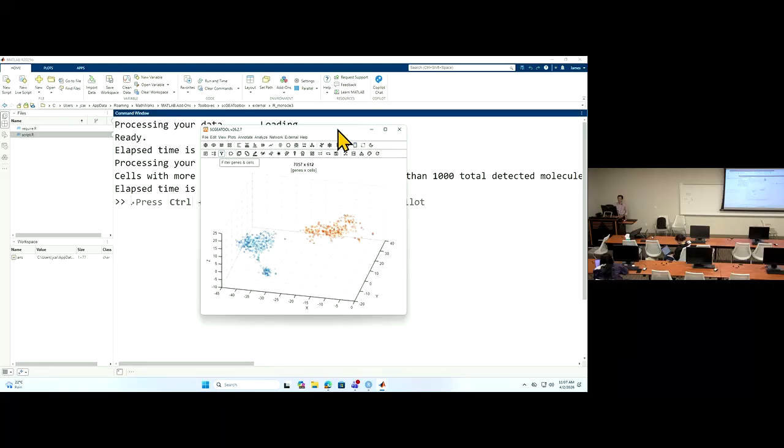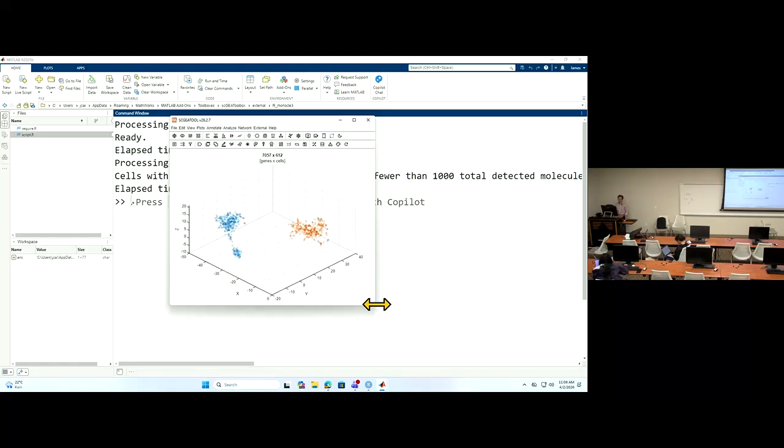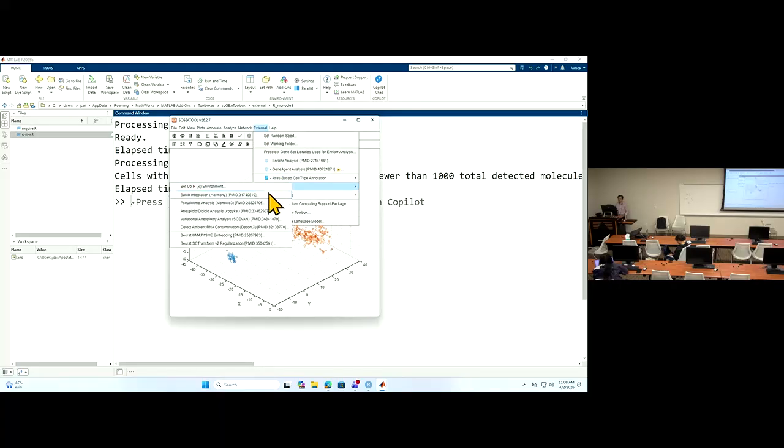So now we have this alpha cell in 2 different time points. We are going to make a trajectory using Monocle 3. And Monocle has its own embedding method, so we don't have to do our own embedding.